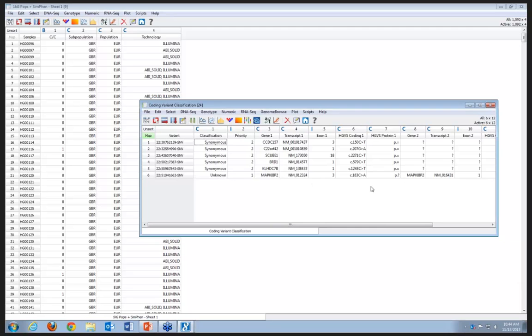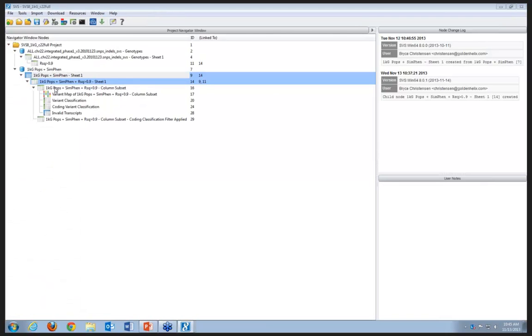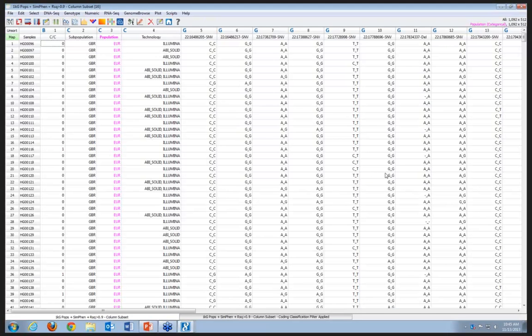And so if we had something here that looked like a potential loss of function variant, we might have something we wanted to follow up on. But since we don't see any one individual variant, what if we wanted to pursue a collapsing strategy? Let's come back here where we had applied those filters, and we just have these 500 or so variants.